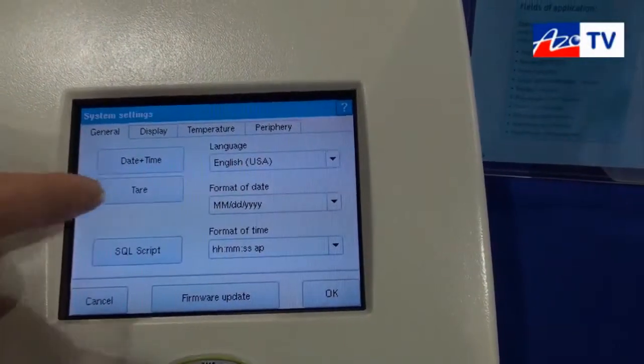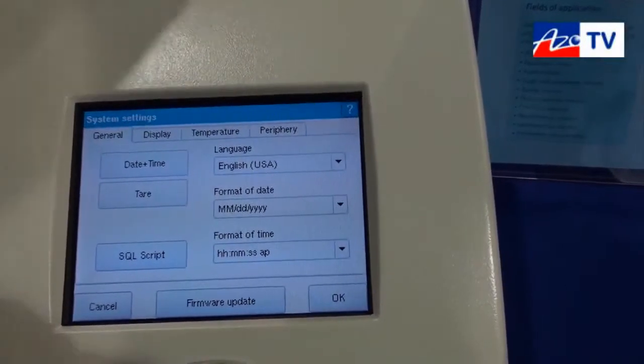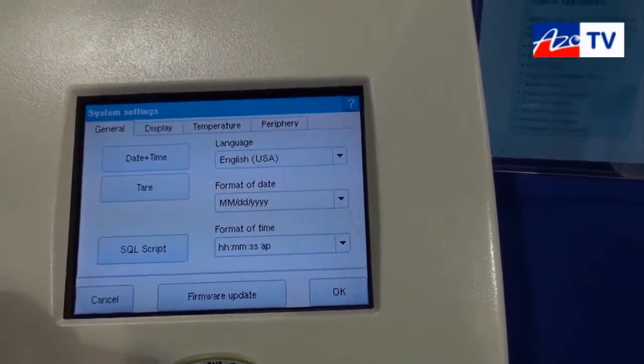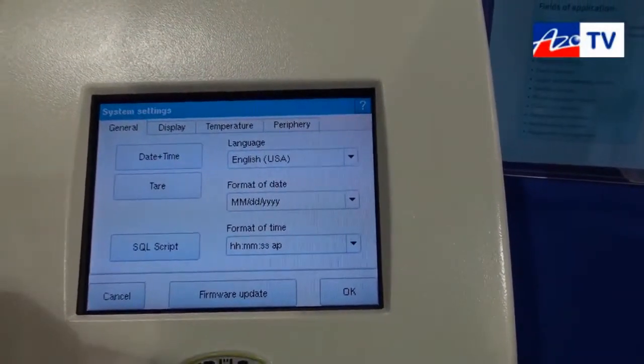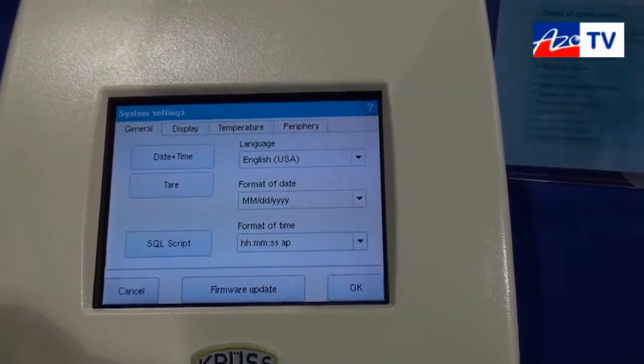The calibration is here — this is the zero. It's very easy to use with calibration liquid or with water. A firmware update is also possible. You can do it with a USB stick — insert it directly into the instrument and put the new software on it.